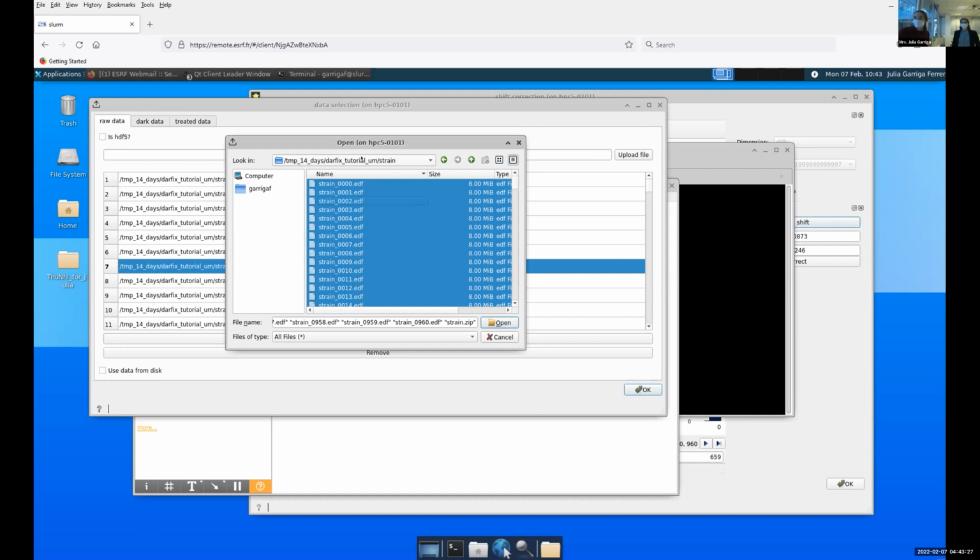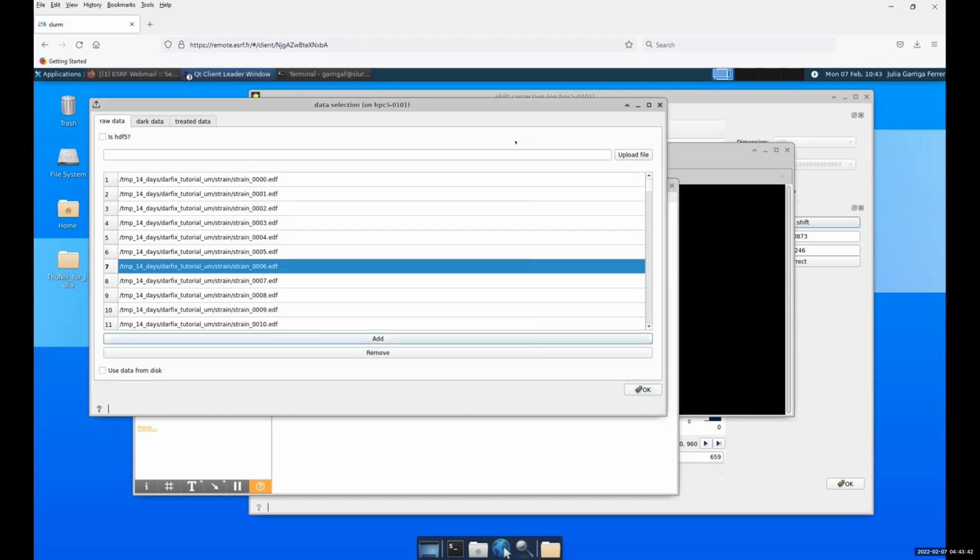Is that true for all of the positions, Tobias? Right now, I tried it only for the different y, but I tried it with personal data with different dimensions, and I noticed when it's toggled on that it's always 0, something in my software. If I don't toggle it on, it finds a normal shift, and it looks pretty good actually. Yeah. But that's just what I noticed. It's maybe because you don't have any shifting type.